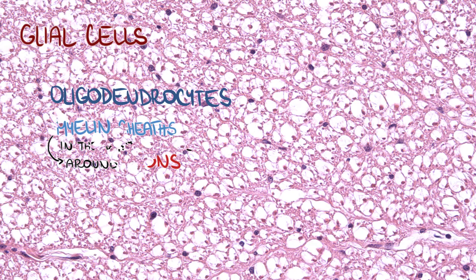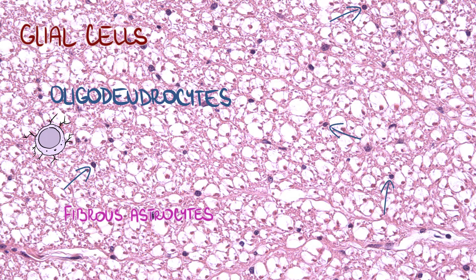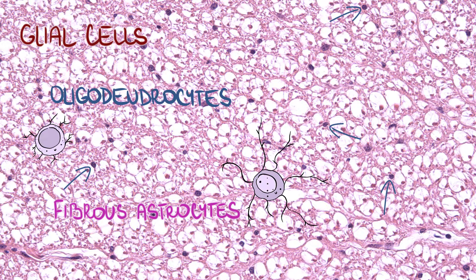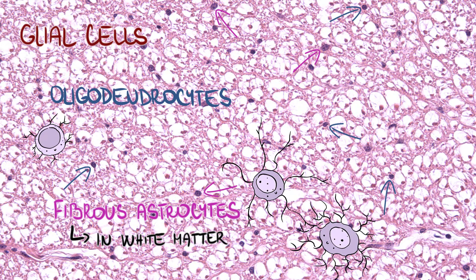There are oligodendrocytes in white matter as well as fibrous astrocytes, which are those big ones over here. We can't really tell them apart based exclusively on appearance of the nucleus. We just know that white matter contains fibrous astrocytes with longer processes.